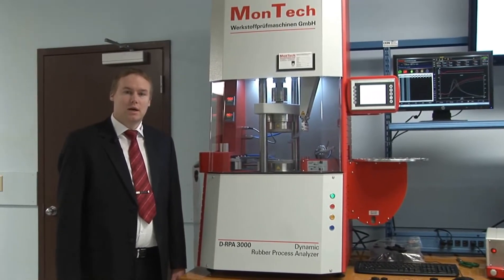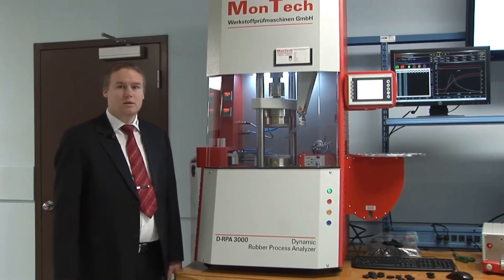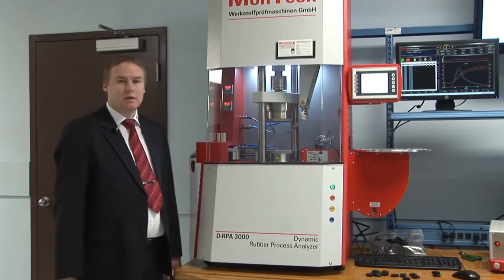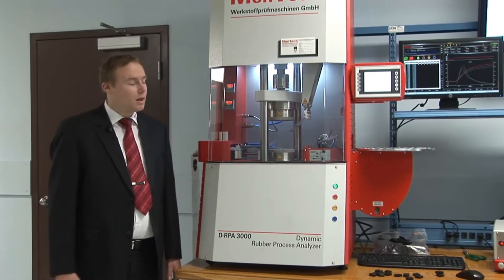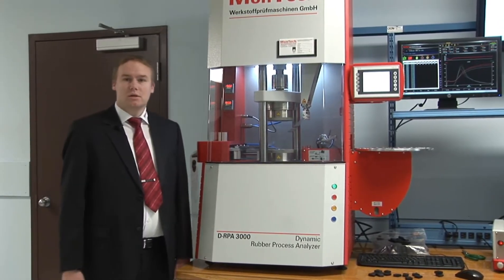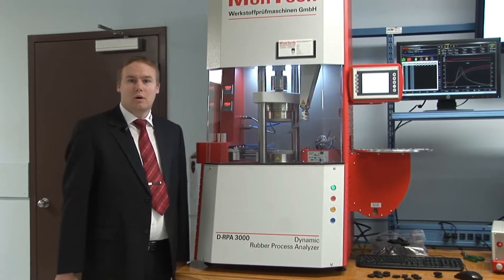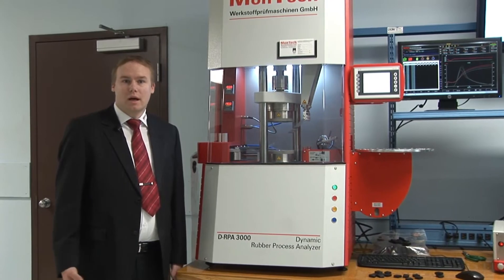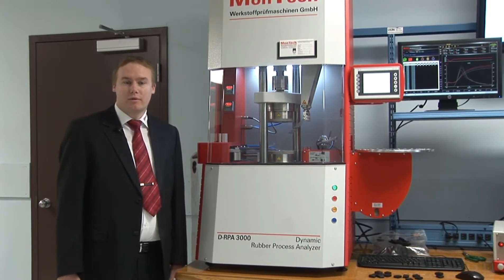Test series are created and then the instrument runs the samples automatically, because this machine is fitted with an automation system. You can have automation systems from five up to 480 samples, which dramatically save labor costs in your lab as well as improve efficiency.